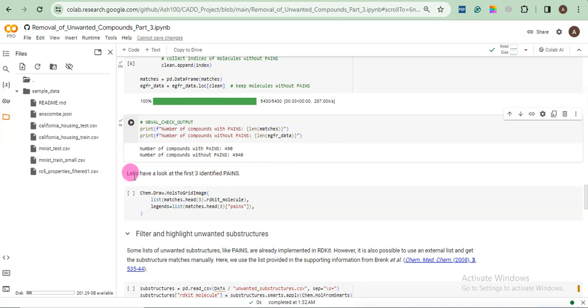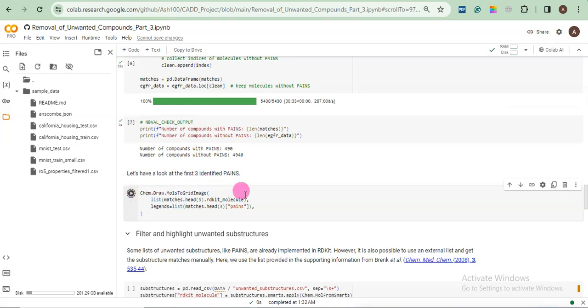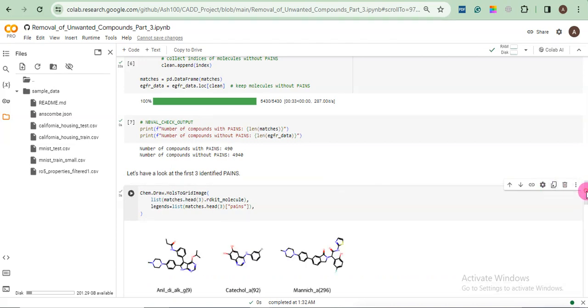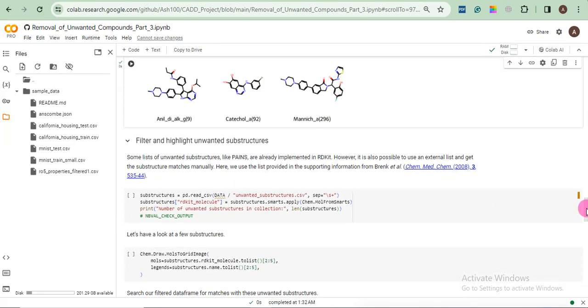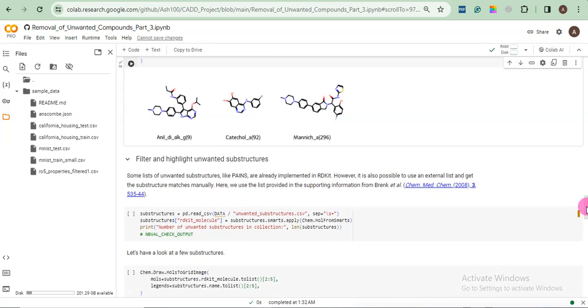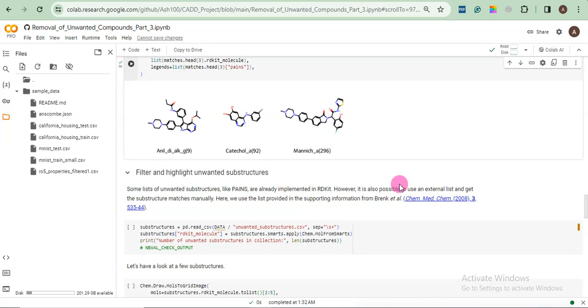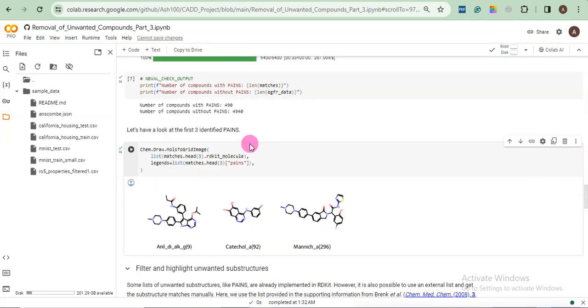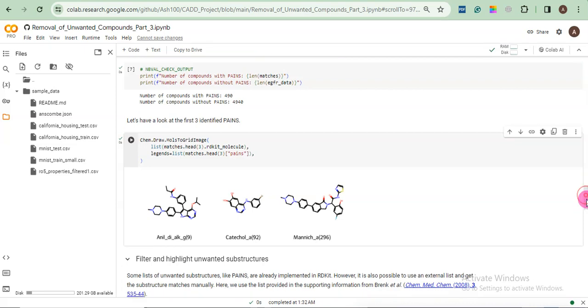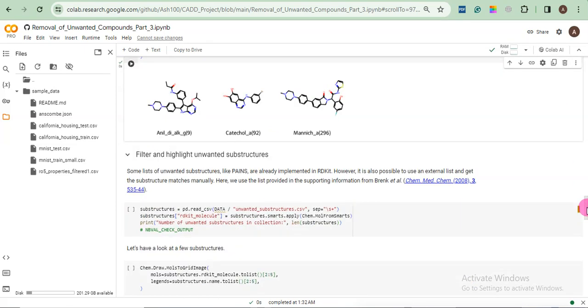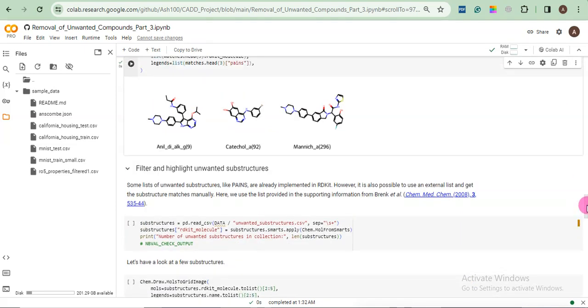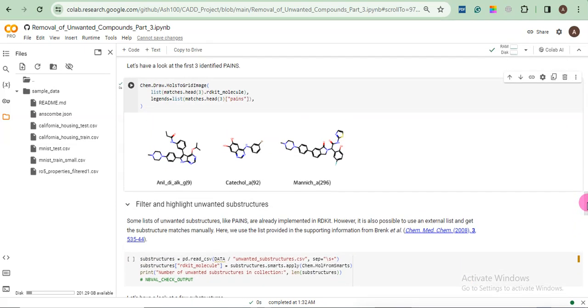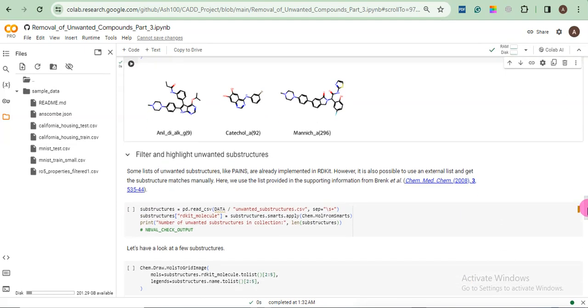Okay. Now here we just want to see the first three PANS. So these are the first three PANS present in our data. In totality, we have almost 490 PANS. But we just showed three PANS. That doesn't matter. If you don't want to see it, it's okay.